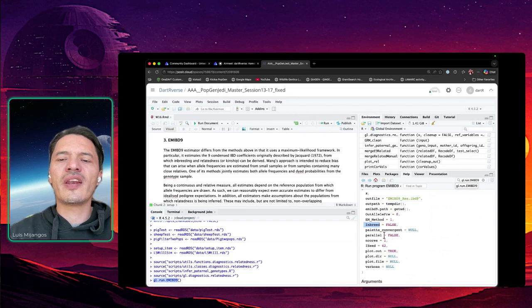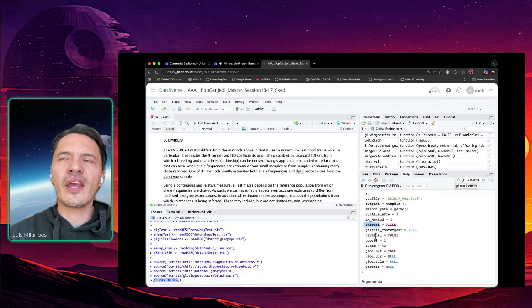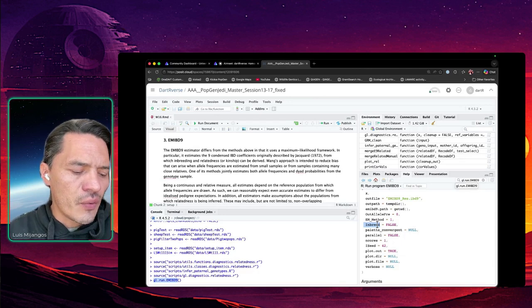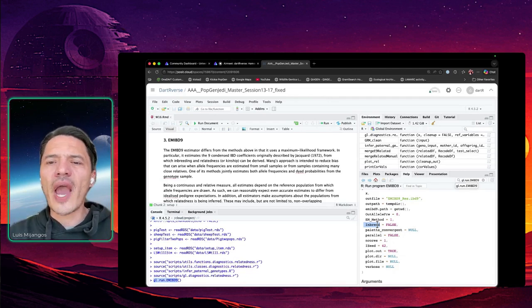And also another nice feature of this program is that we can use parallel true and use as many cores as we have on our computer. Actually, the binaries for using the parallel version are not working, but we have been working together with Jinliang Wang, and he has provided us with the source code of the program, and we have compiled it for different systems.